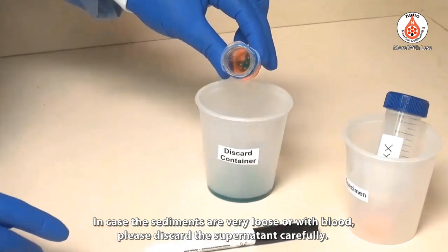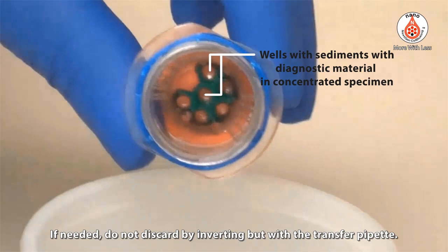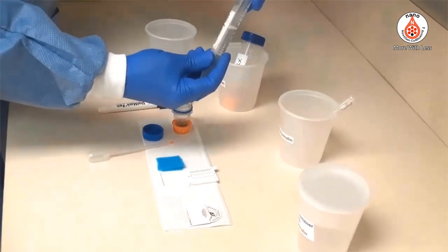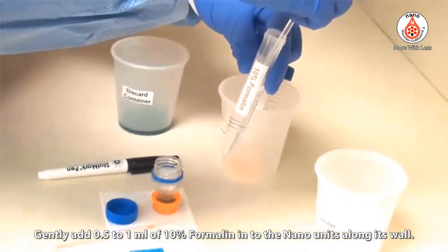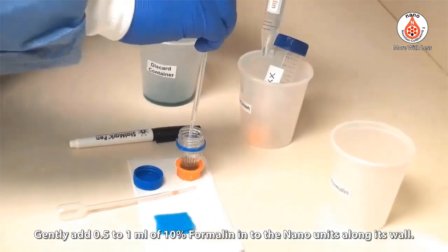In cases where the sediments are very loose or contain blood, please discard the supernatant carefully. If needed, do not discard by inverting — instead use a transfer pipette. Then gently add 0.5 to 1 milliliter of 10% formalin into the Nano unit along its wall.